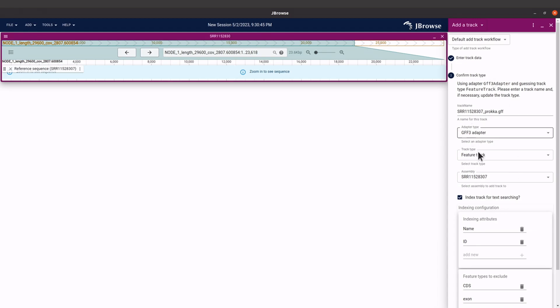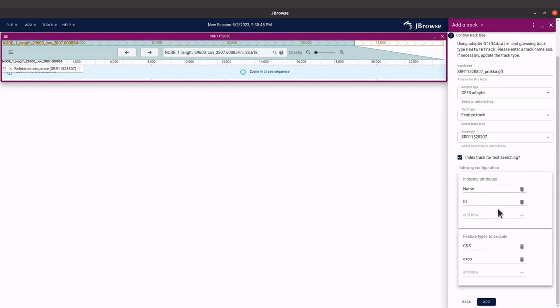When you click on 'Next' you have this window — leave everything as it is and scroll down. You will see this, and we will leave them as they are. Then just click on 'Add'.